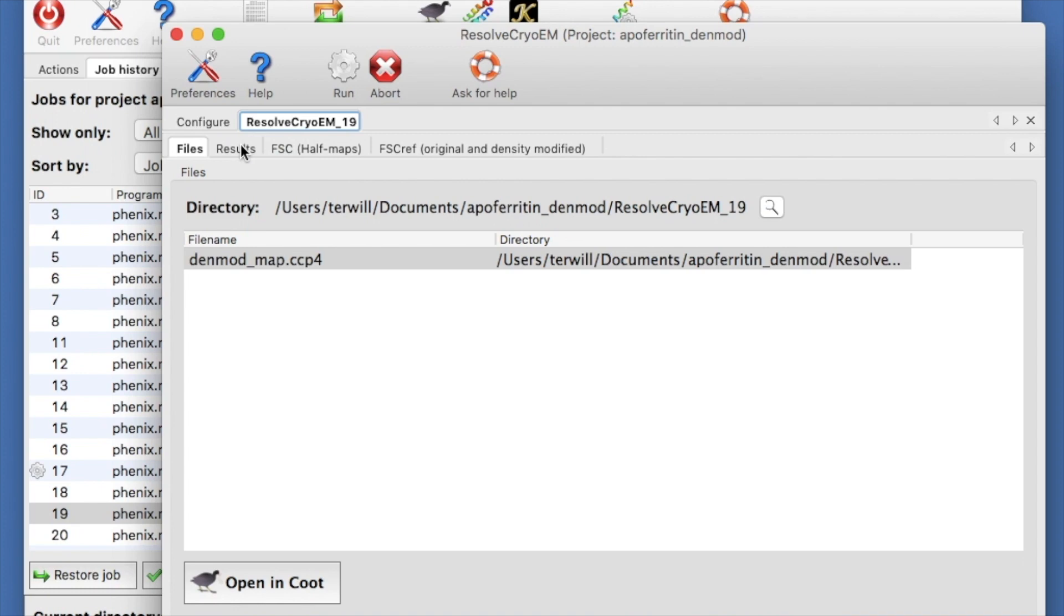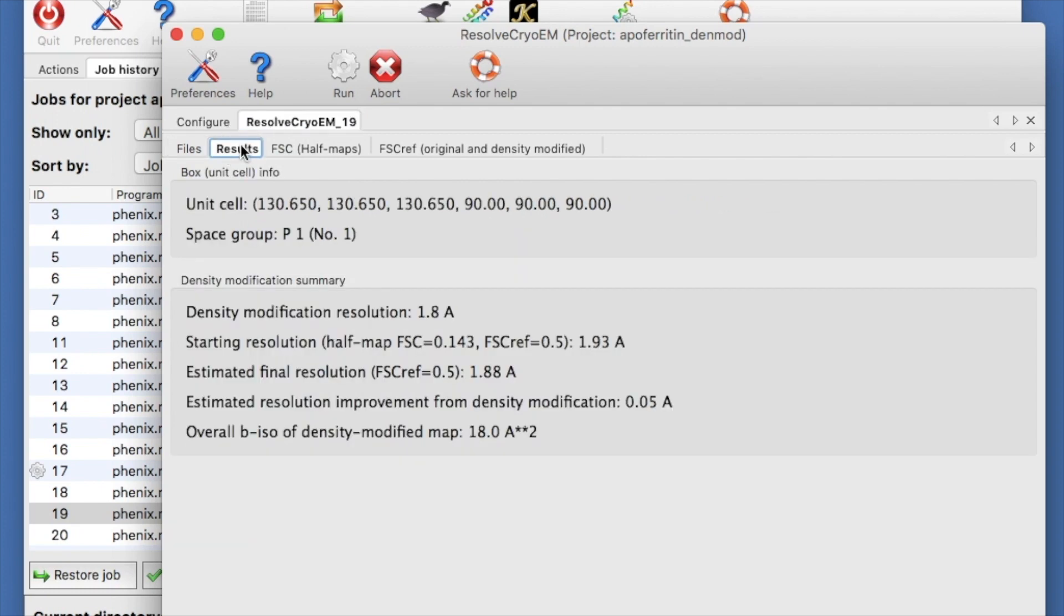After about 15 minutes, we get a new Results tab that shows us the resolution used in density modification, the starting resolution, the final resolution, and the estimated improvement.